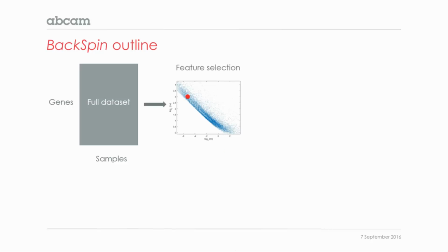And this is standard in single cell. I think today many people use this kind of approach, basically plotting the log of the CV versus the log of the mean, fitting a line, and then selecting the top genes that are above this fitted line as the highly informative genes. And again, this is not based on a standard variance filter, but on this fit of the CV versus mean approach.